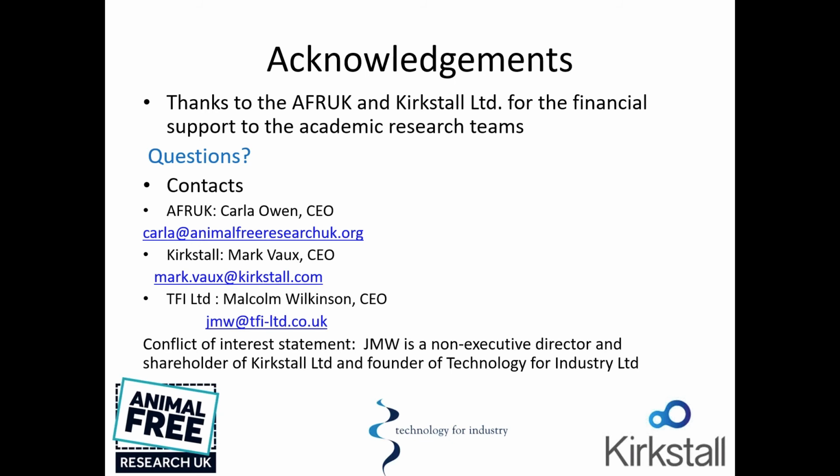The important thing there is to be able to model and measure how much binding is going on and have alternatives. So, for example, we have different chamber materials in Quasi Vivo. We have acrylics and polymers. PDMS is one of the ones we use. And for tubing, you can use, for example, Teflon tubing.